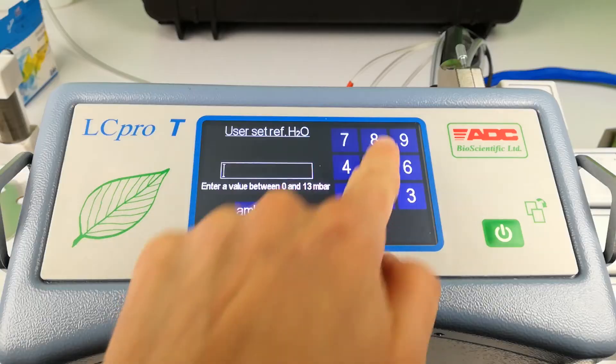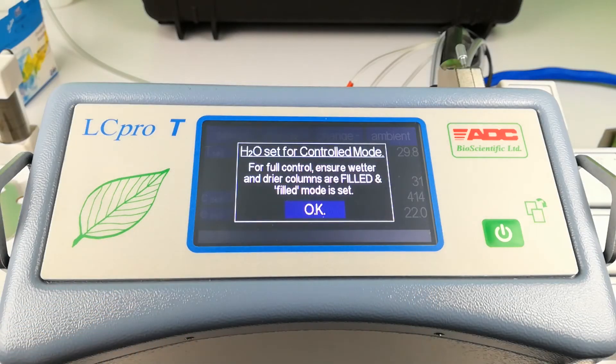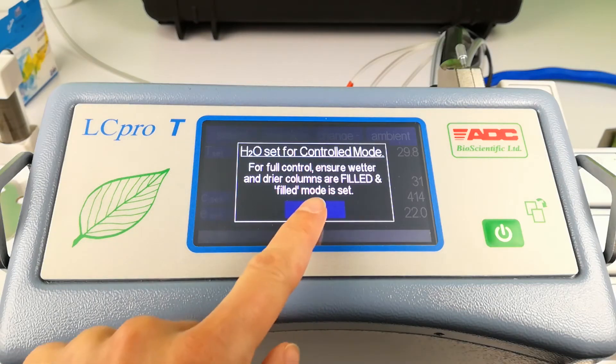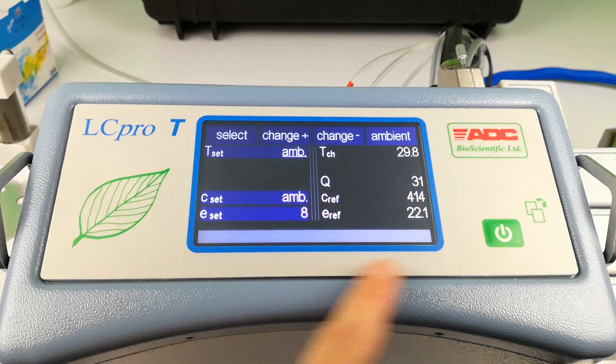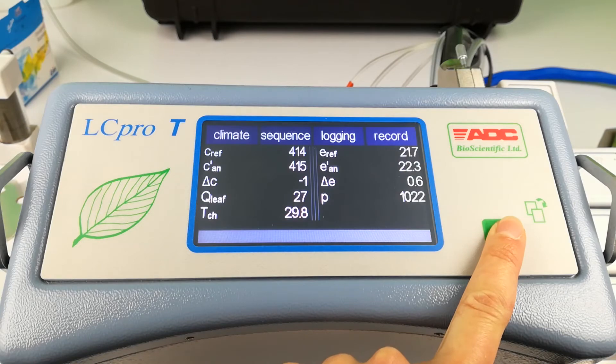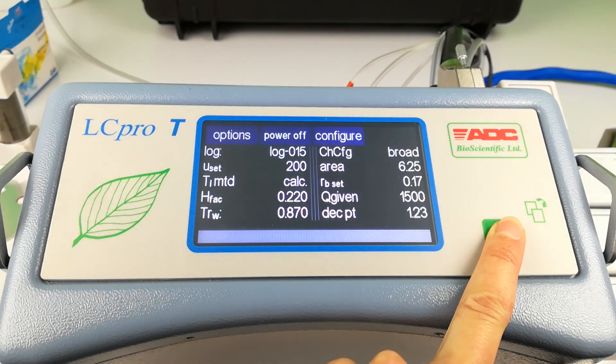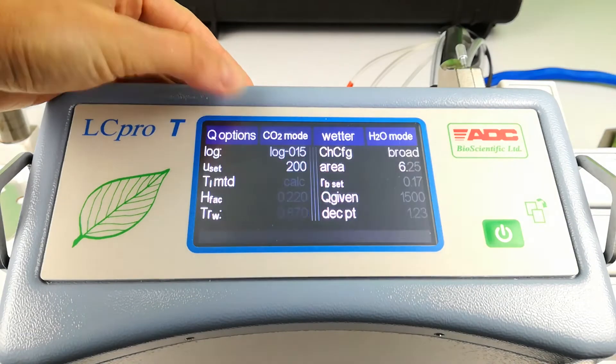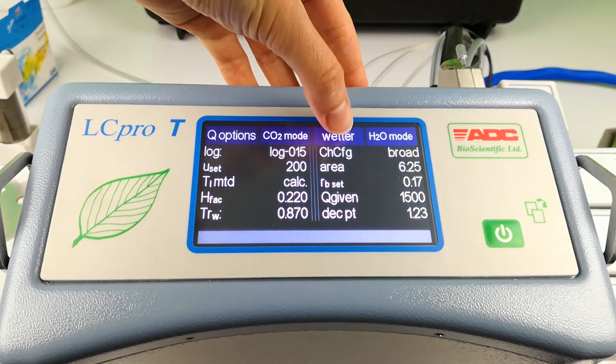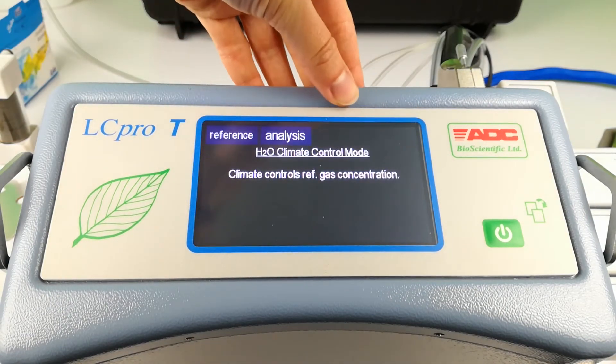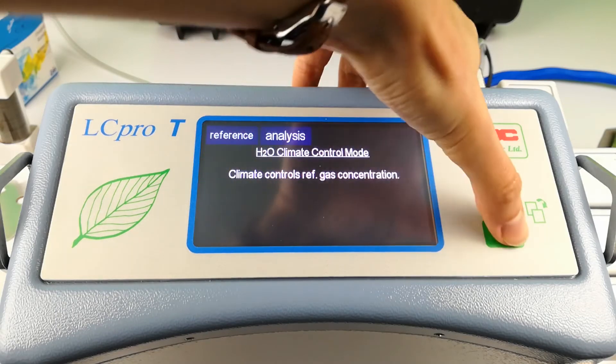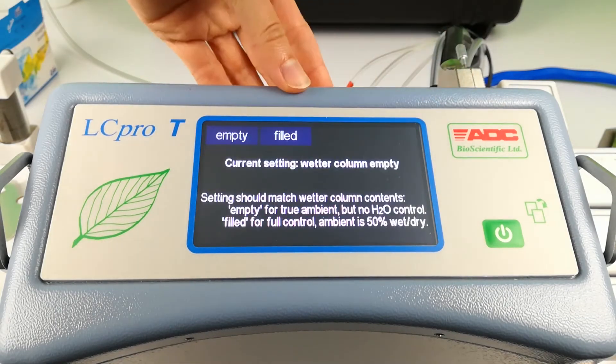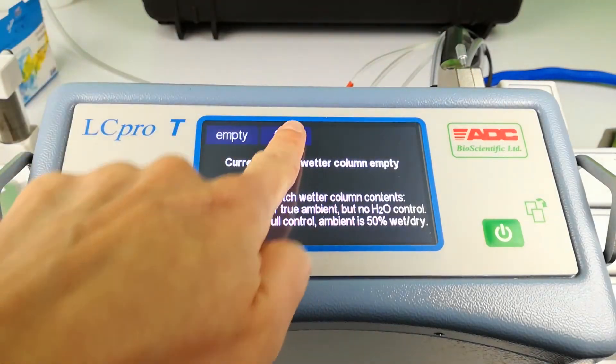Select the reference H2O value. Enter options. H2O mode. This will give you the option to control on reference or analysis. This can remain as the default in most cases. Select wetter column as filled now that we have filled the wetter column.